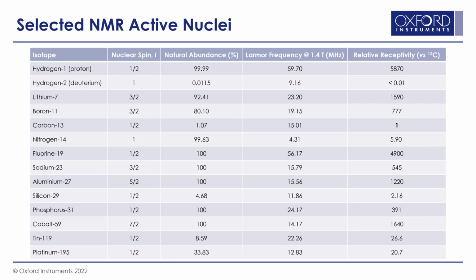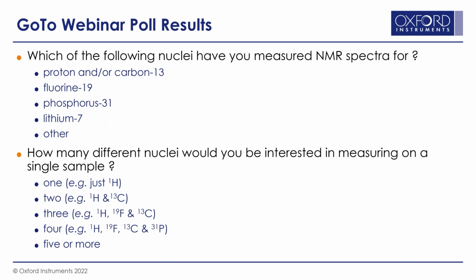These parameters for selected NMR active nuclei of interest to both NMR spectroscopists and the wider chemistry community are shown here. Before we go into detail, though, on the various NMR active nuclei, we'll have a look at your answers to our poll questions.